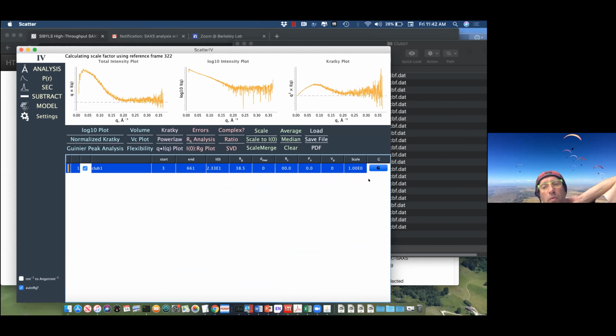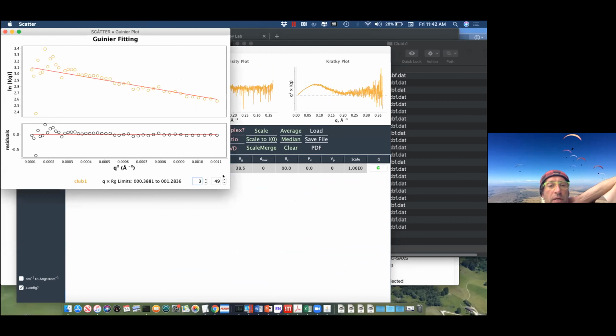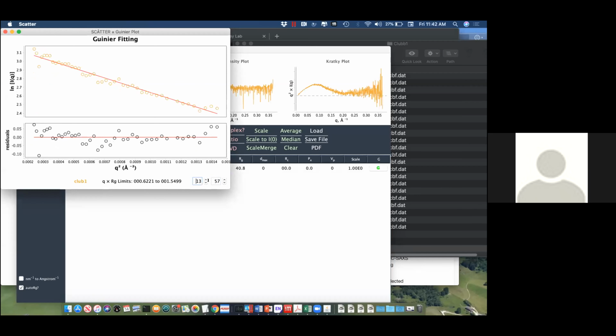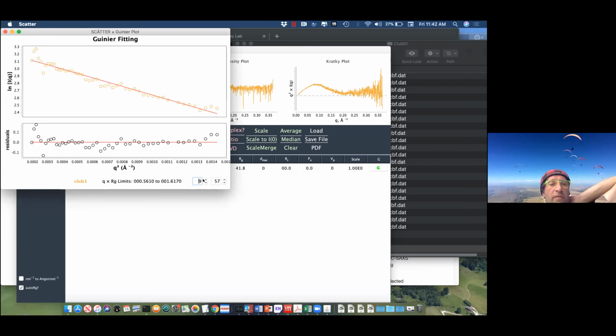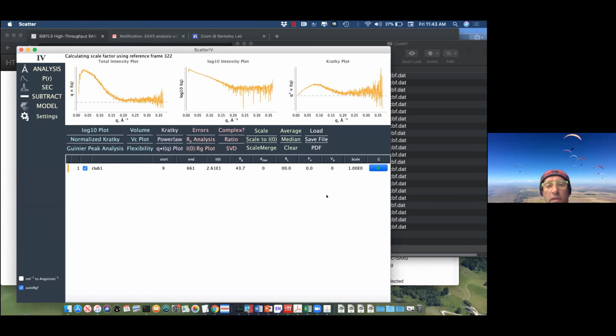We don't want to go too far, just brief. Look at the Guinier plot, and you see it's a pretty linear Guinier plot. You probably don't want to use those first noisy data, so you can deselect that. But the linear Guinier plot indicates that you have something aggregation-free, and as you also see in your size exclusion, the aggregation is nicely separated from the protein.